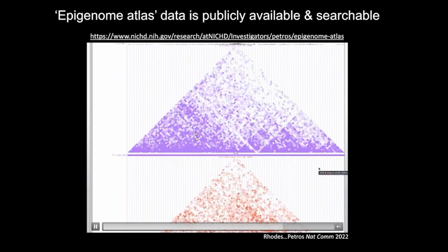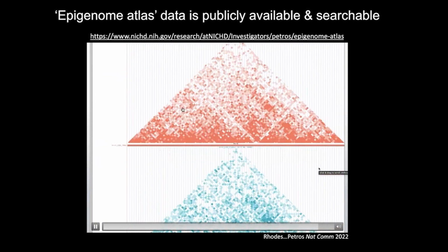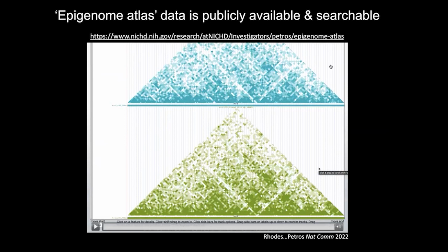So what you can make out here is that enrichment, MGE-specific enrichment I talked about before. That's again absent in the LGE. So we hope that researchers can go to this website and explore differential expression and gene regulation in these different brain regions in the mouse embryo that are relevant for their research.